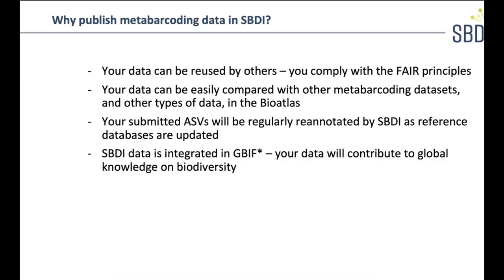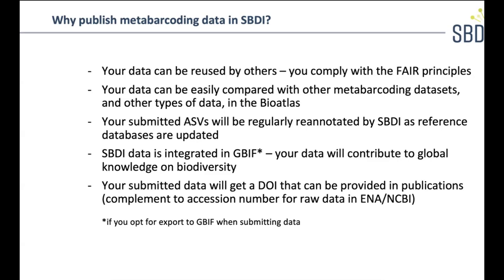SBDI is integrated in GBIF, so your data will contribute to global knowledge on biodiversity, which is really cool, I think. And then your submitted data will get a DOI that can be provided in publications. So it will complement the accession number that you get for the raw data in NCBI. Here you get the DOI that you can use to track the ASVs.